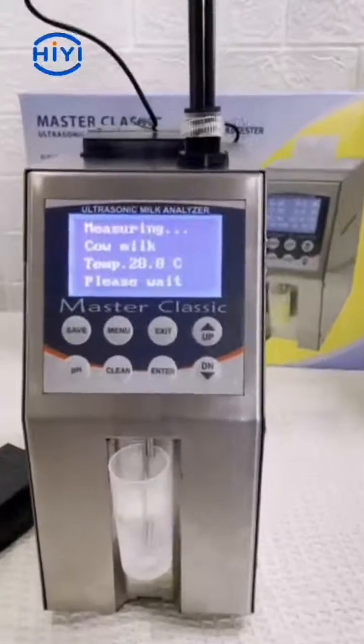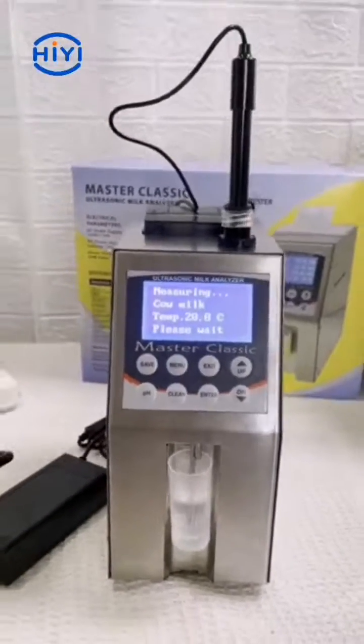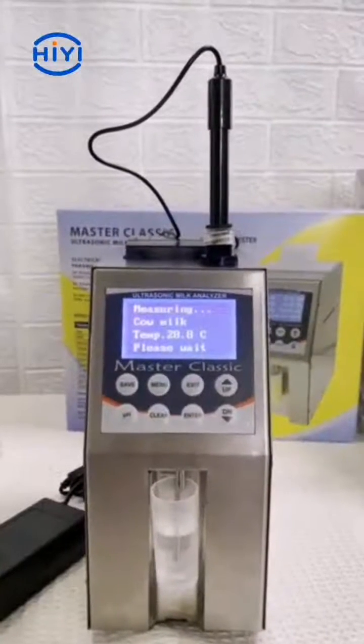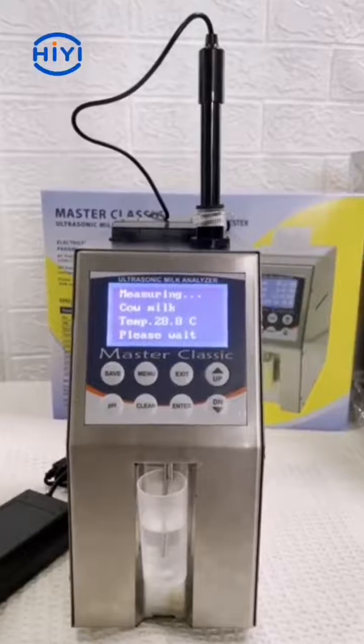First it will show the temperature of the sample. The measurement time is about 60 seconds.